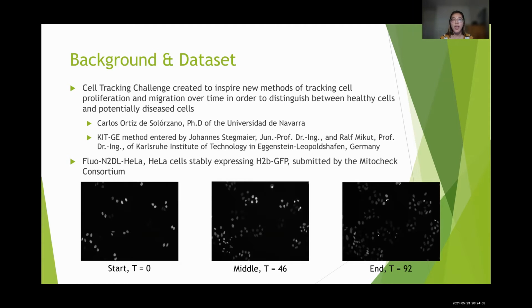The dataset we'll be looking at is the Fluo-N2DL-HeLa, which are HeLa cells stably expressing H2B-GFP, which is used for imaging, and these were submitted by the Mitocheck Consortium. This is a 2D dataset, and you can see some example frames below.